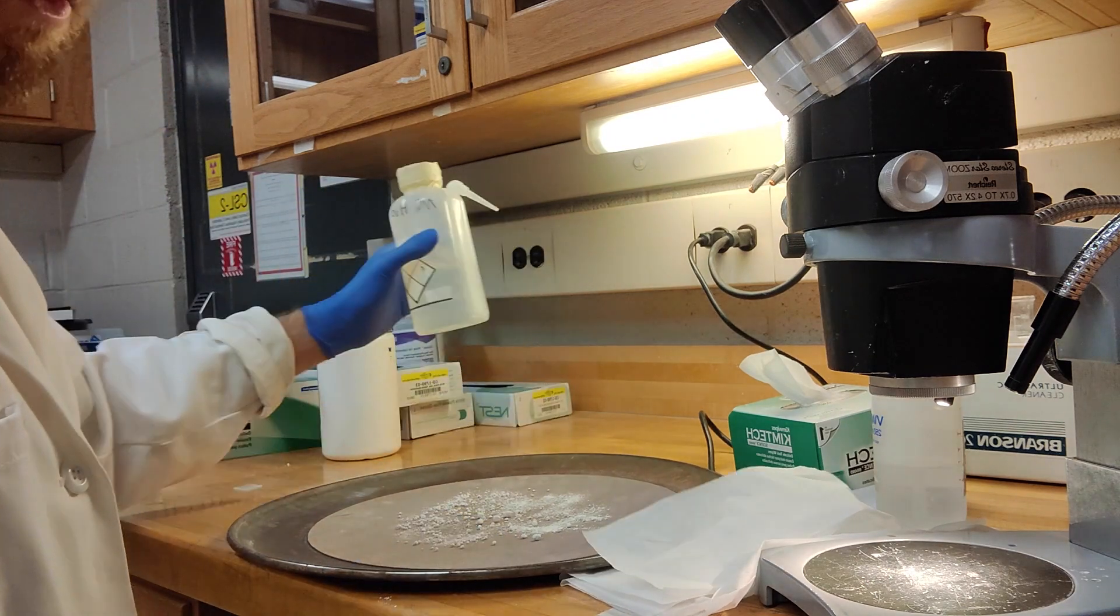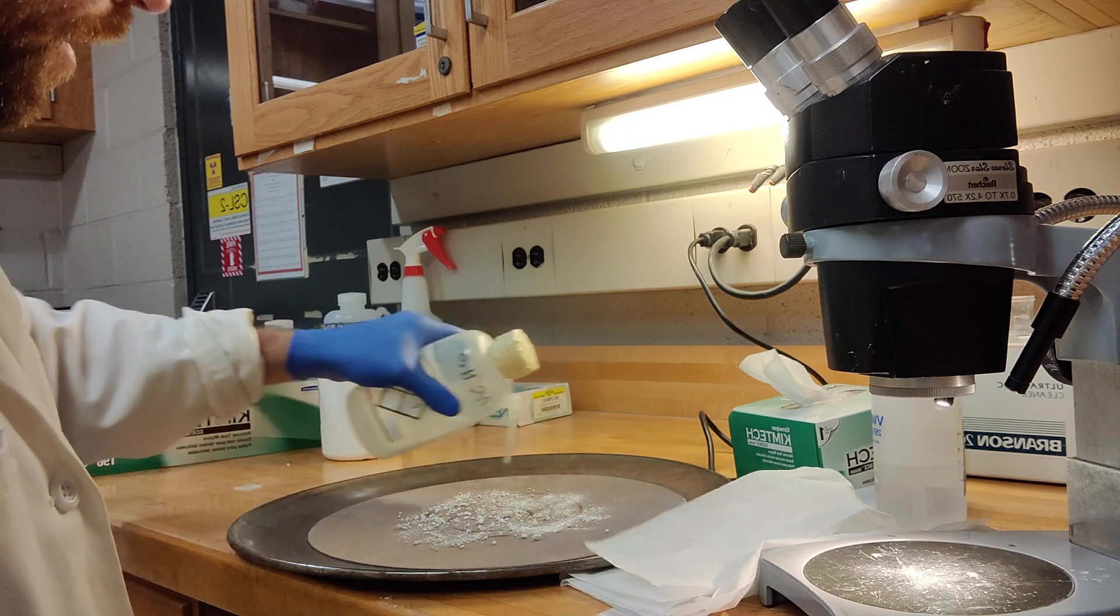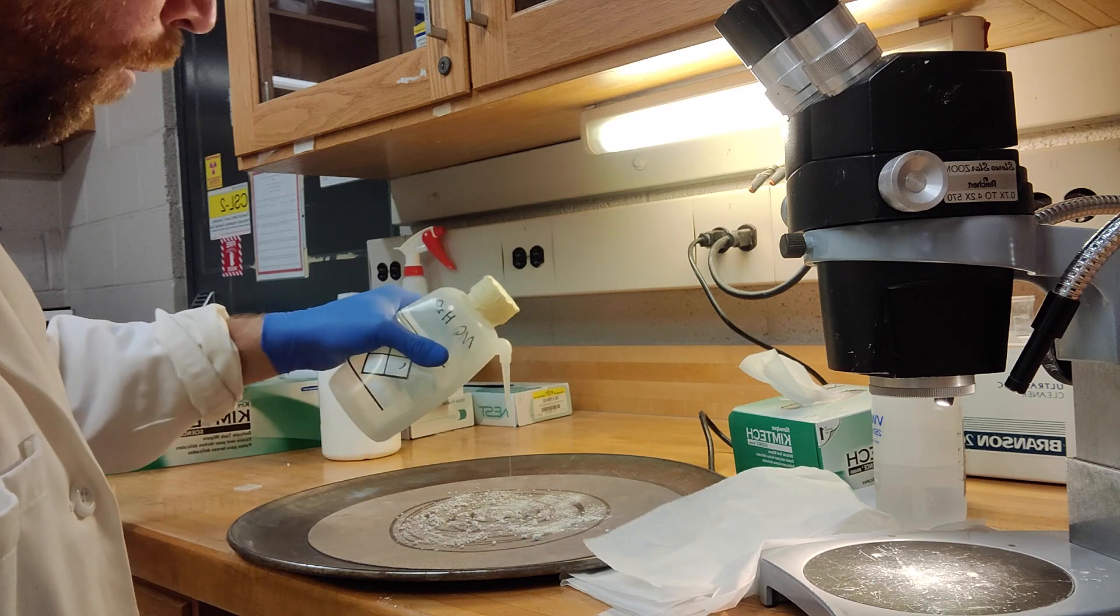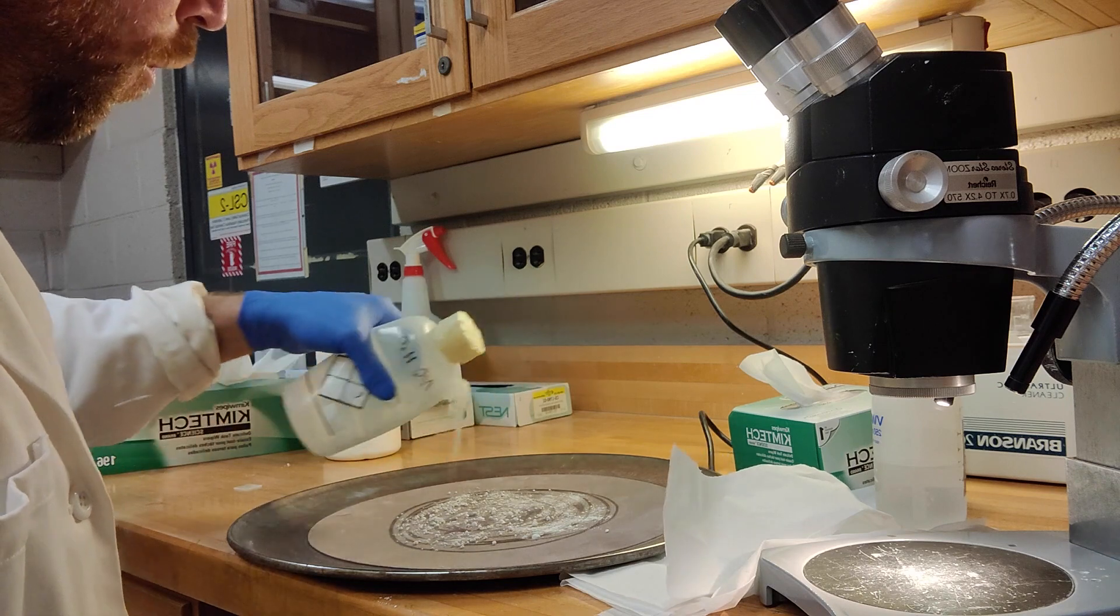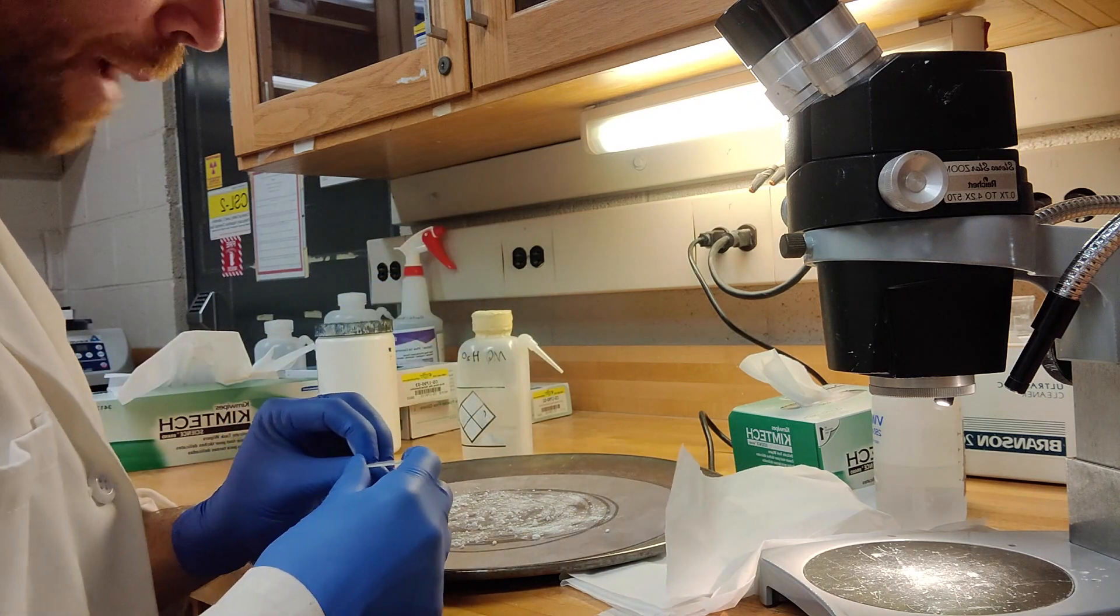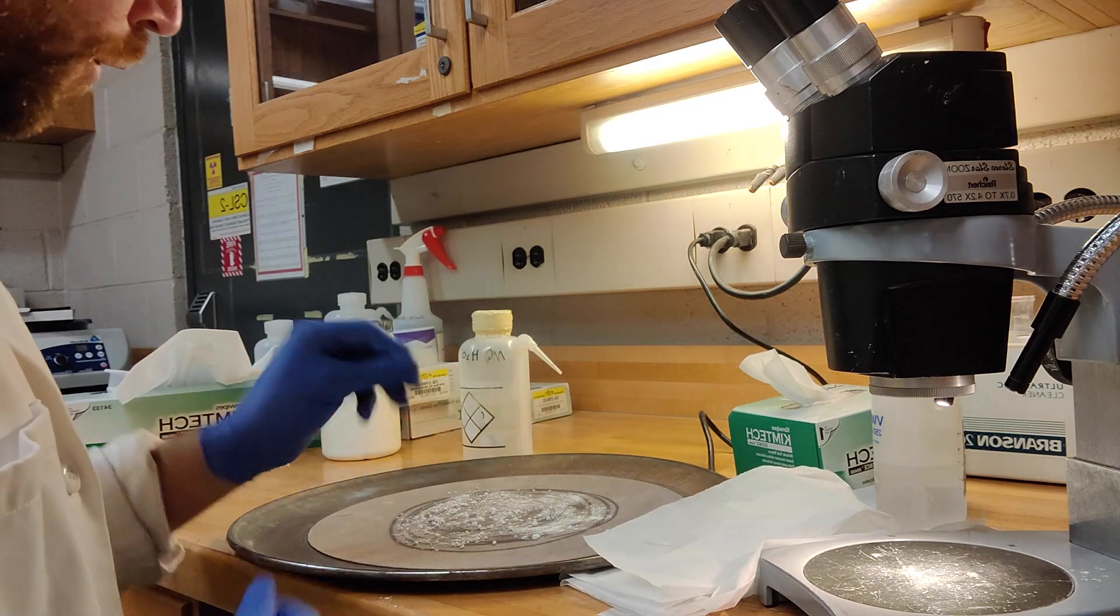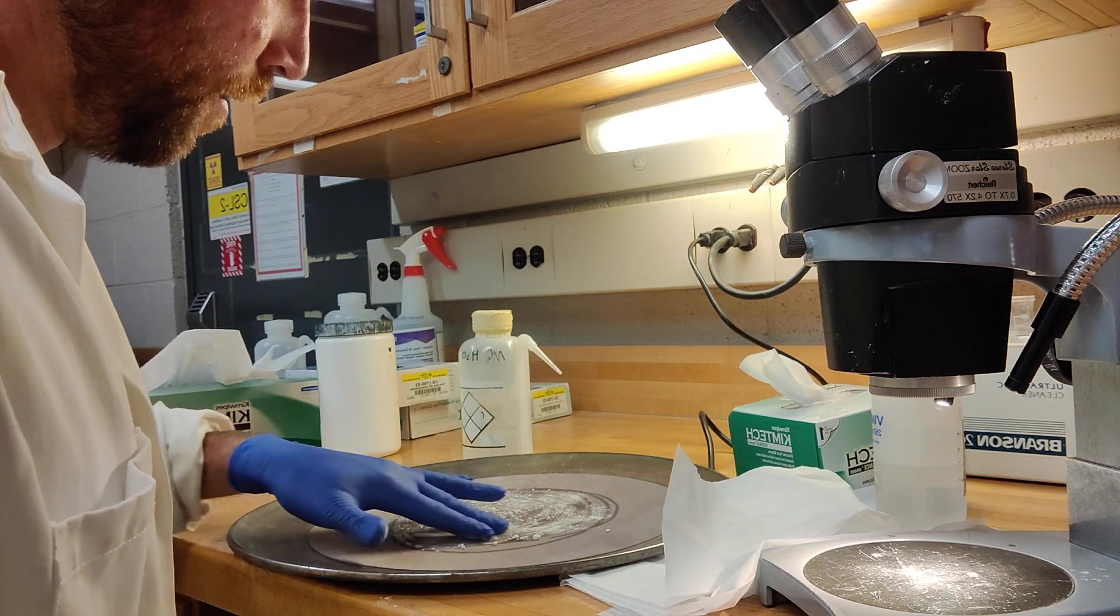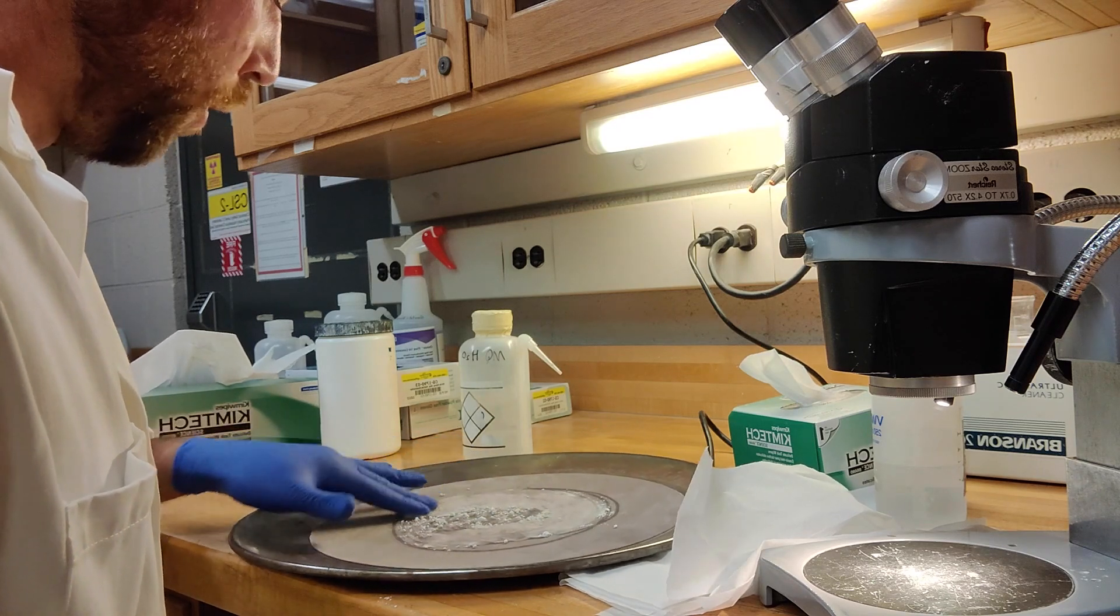And then all you do is take the water and just drizzle it over the micron powder. You can add more water. You want this to be fairly well lubricated. If it starts drying out, add some more water. Unlike the lapping film, you can afford to be a little bit more liberal with the amount of water you use. And then all you do is basically take your little mount and then move it around the polishing cloth.